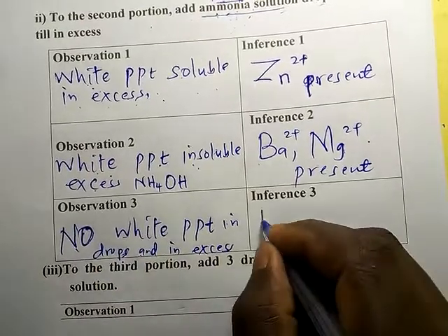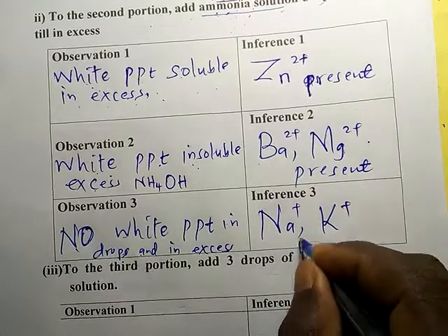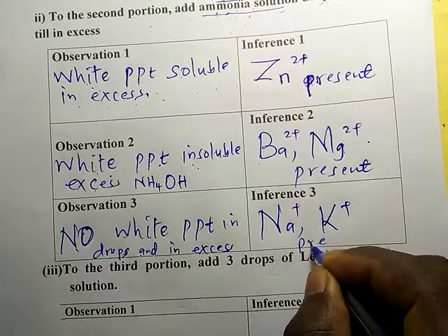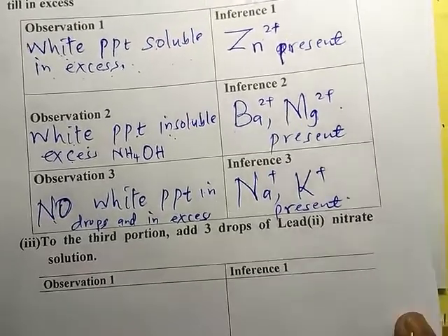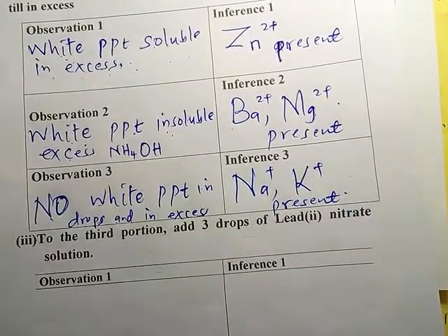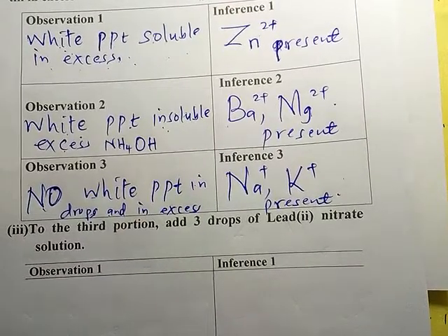So that simply means that sodium and potassium are present. I have left out the ammonium ion.